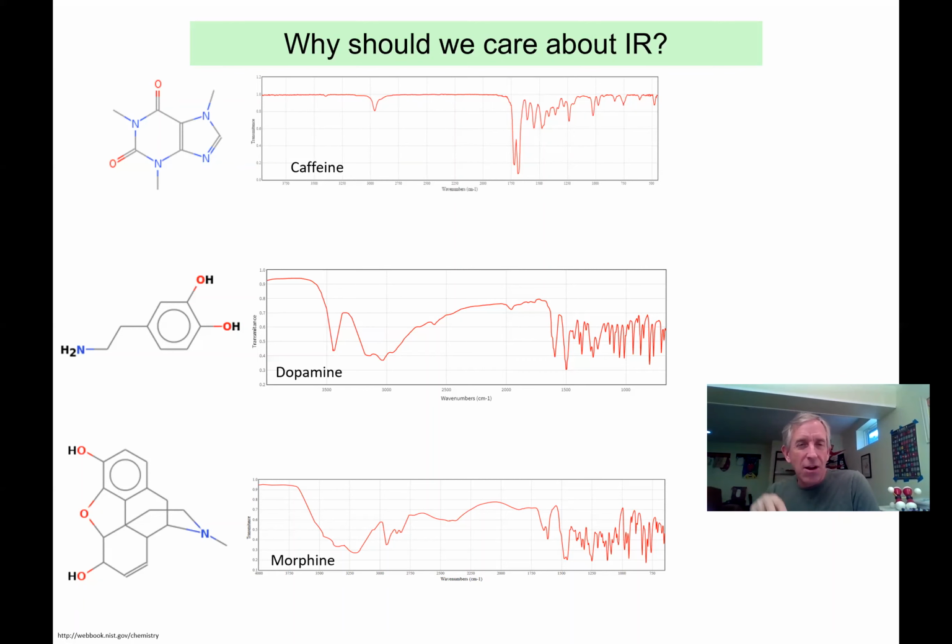And notice that in all of these, on the right-hand side of the spectra, it looks really busy. A lot of peaks pointing down, tons of stuff. And I want to let you know right now, you could cut this IR essentially in half and throw that noisy section away, because we will never analyze that noisy, heavy peak section. Why will we never analyze that piece? Because the information that's coming out in that region is redundant to the same information we can get out in the higher region. So we don't need to get that kind of redundancy built into our dual unknown labs.